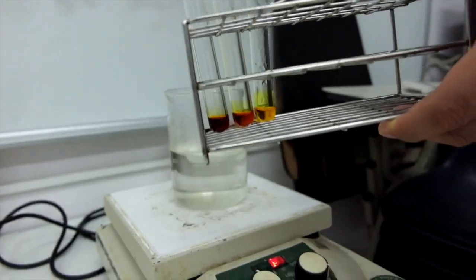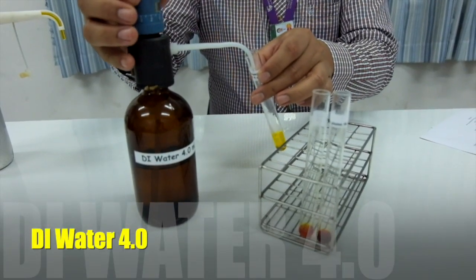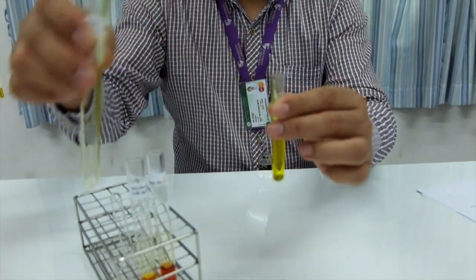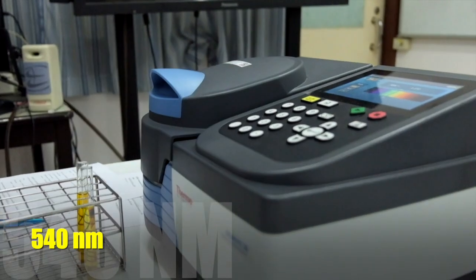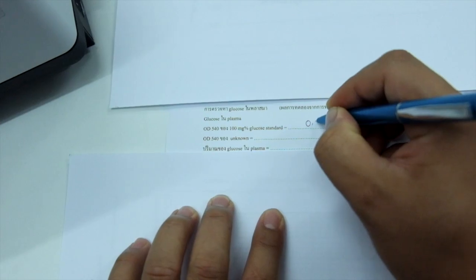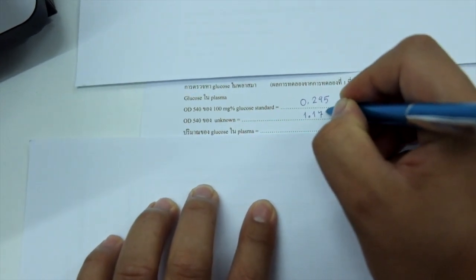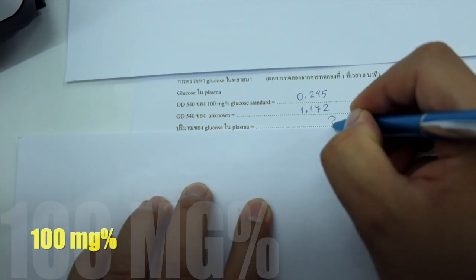After that, cool the solution down through the running tap water. Add 4 ml of distilled water into all test tubes and mix well. Pour a certain amount of the solution in each test tube into cuvettes. Measure the absorbance of all cuvettes at 540 nanometers using the distilled water sample tubes for setting 0. Record the absorbance and calculate glucose concentration in unknown fasting plasma, referring to 100 mg% standard glucose absorbance. Take a note for the calculated result.